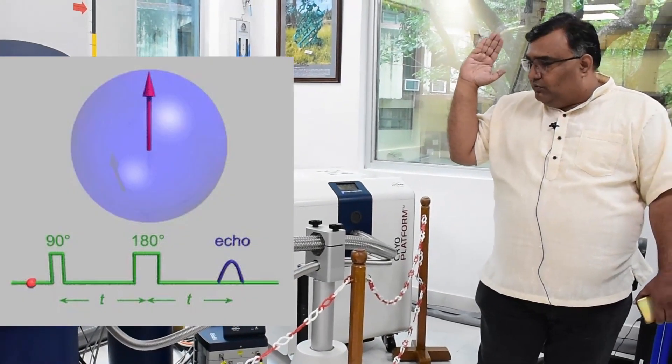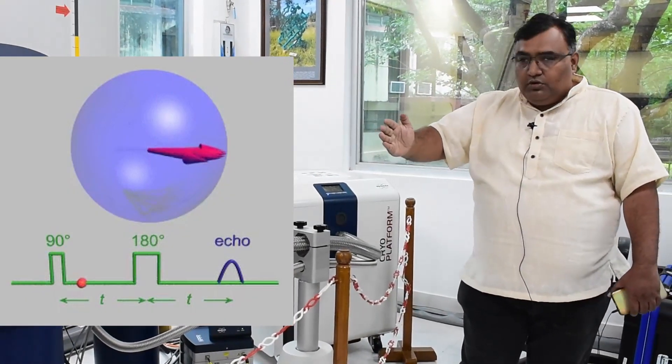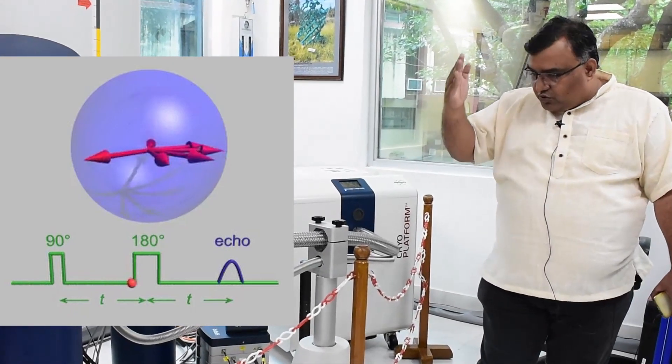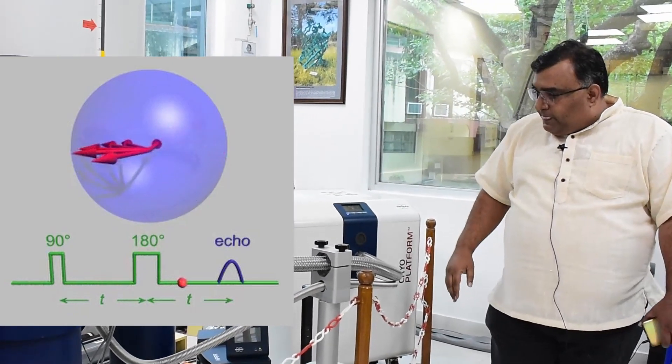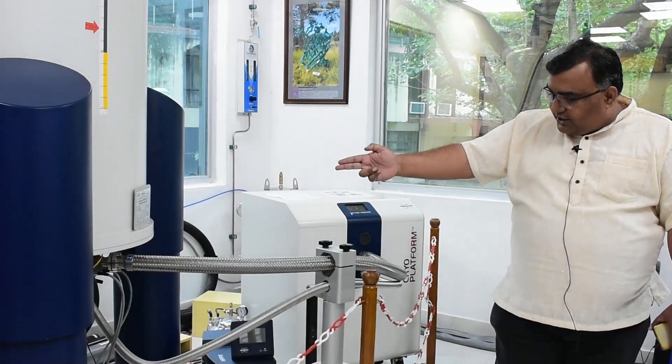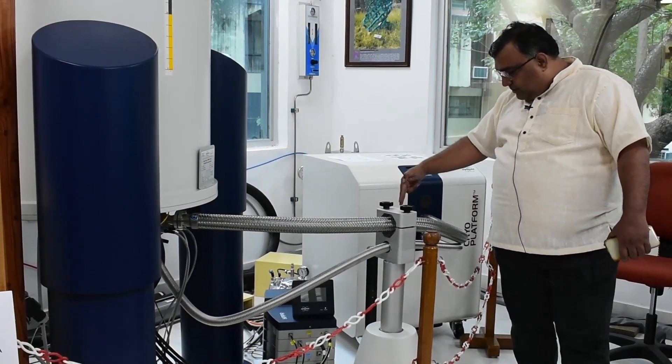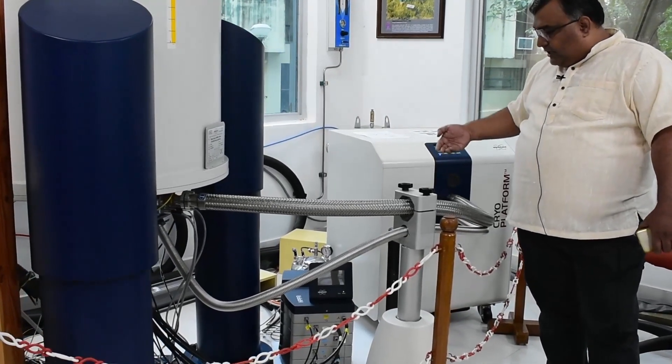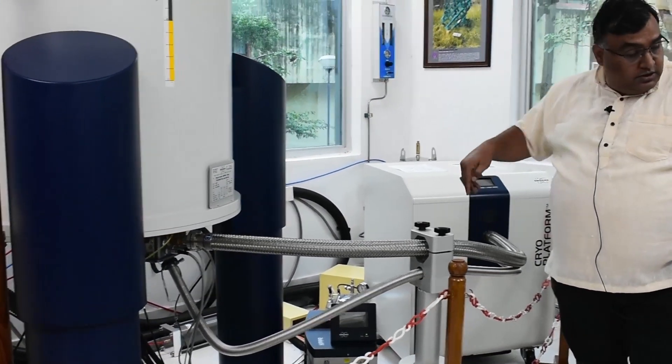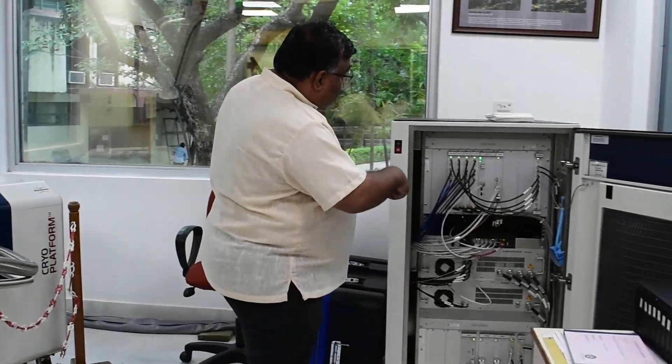And once the coil hits the pulse, the magnetization that is aligned along plus Z gets tilted into if it is a 90-degree pulse, gets into the XY plane. Now on the return path, the detector detects it. It comes again to the pre-amplifier, cold pre-amplifier first, then the pre-amplifier and the pre-amplifier further enhances the signal and you get it back to a detector.